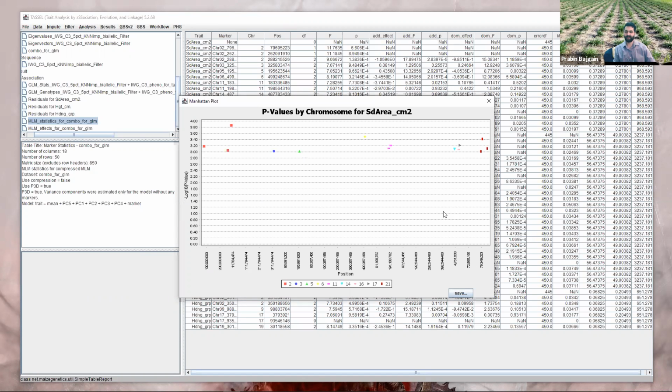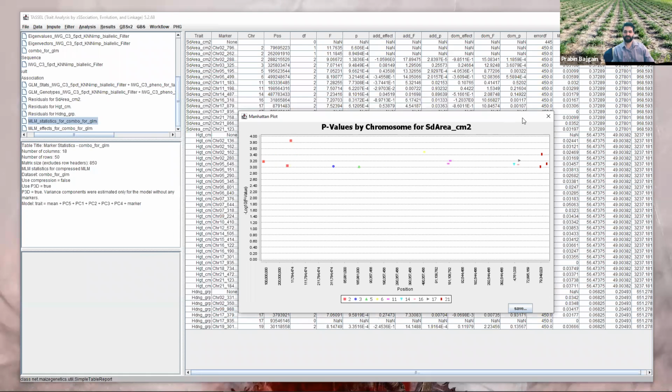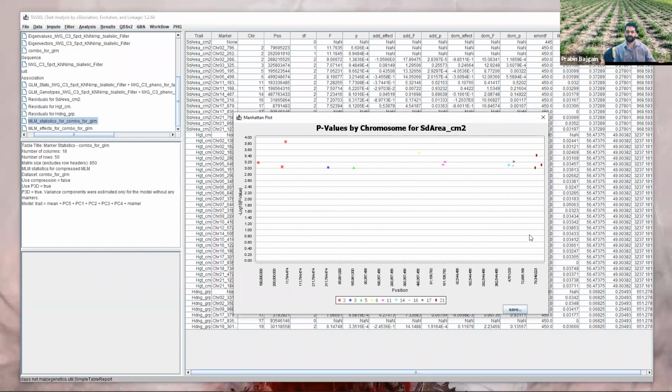Everything is blank down here because, well, we threw this out. So for that reason, you might not want to do this, but for a quick copy paste or quick saving of just the significant, and you don't want to sort later, it's a good idea to do. Keep the filter on and then only get the significant hits.